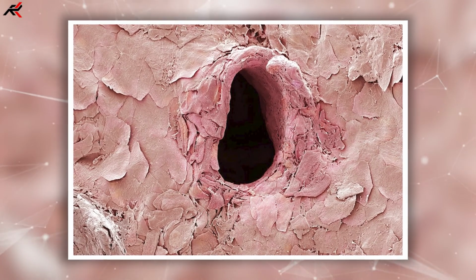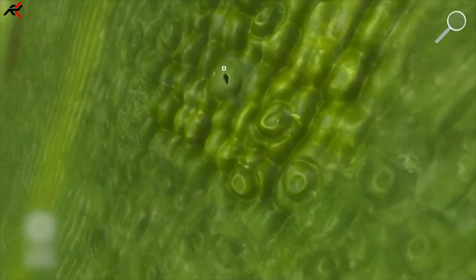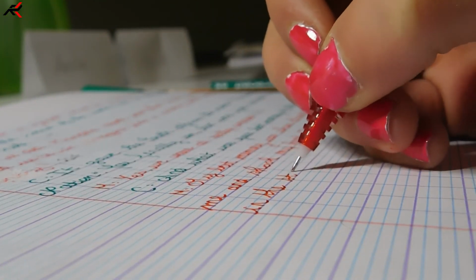But have you ever thought how your skin looks in the microscope after a mosquito bite? If you haven't seen, then definitely watch our video till the end because today we are going to see something which you can only see in the microscope. So let's begin. The pen is a very important thing in our study life, which you have also used.